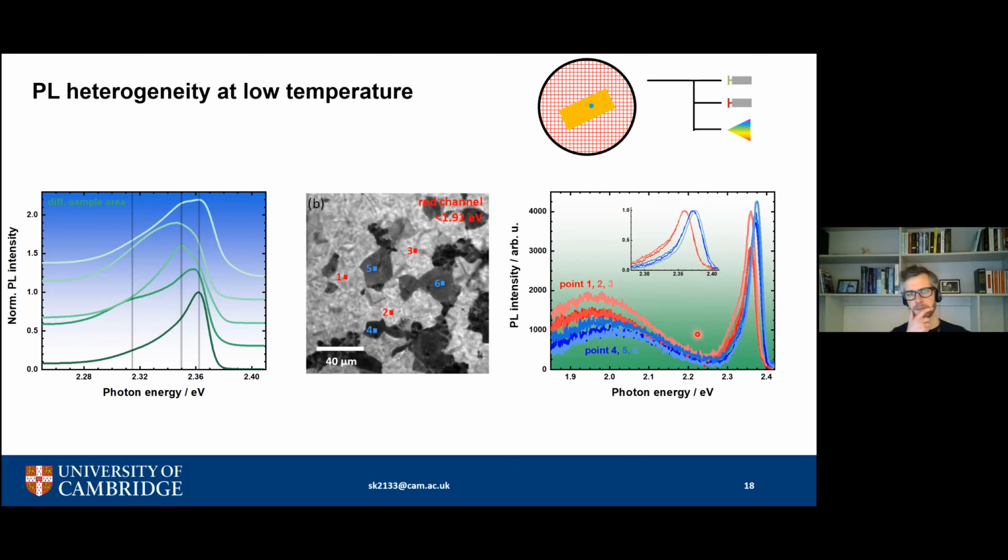So in other words, when we look at the macroscopic PL here, and we see all these subpeaks in our PL spectra, this is not because there's one material and there's one, let's say, bound exciton or a dark exciton in here, but there are distinct properties of distinct crystallites. So at least 2 types are available here.